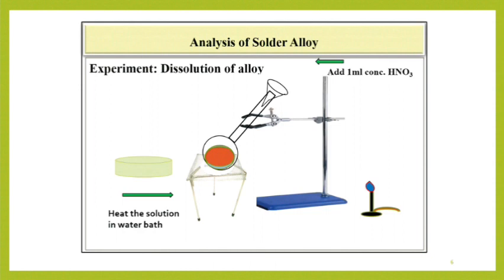Then heat the solution in a water bath for about 5-10 minutes. If the alloy does not dissolve, again add 5 ml distilled water and 1 ml concentrated HNO3 and repeat the procedure till the alloy completely dissolves.